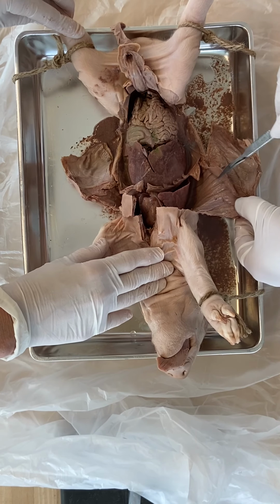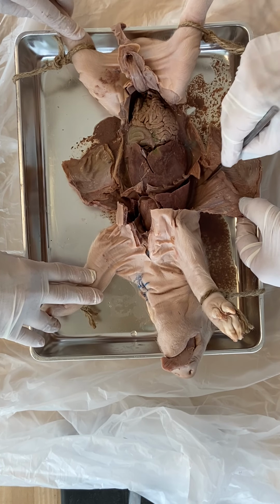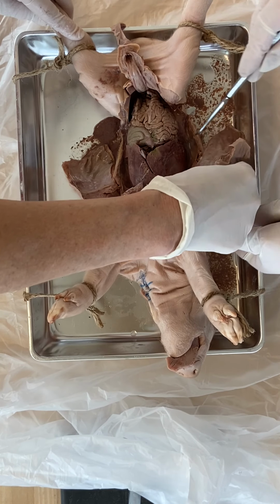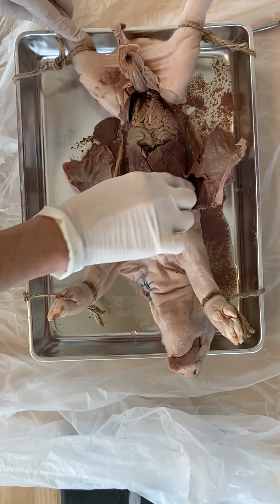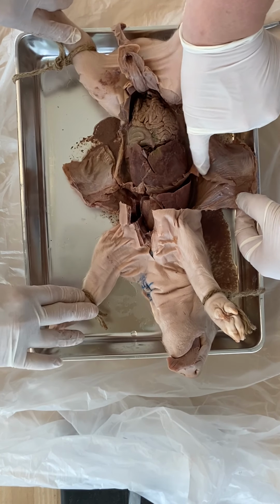So while we're here, here's the ribs. There we have the ribs and the intercostal muscles in between. So you can see the muscles in between. It's interesting that the diaphragm comes way up with these ribs, following the rib line. And the attachment. And they're shaped as we did with both systems.